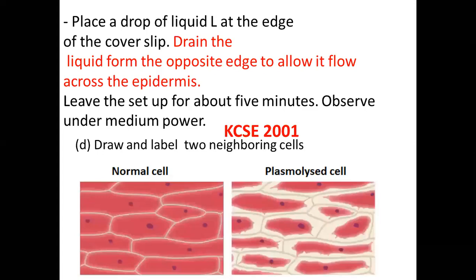And that's why it's also good to know how a normal cell would look, and then how it will get plasmolyzed. So the 2001 practical was another level. And you see, NEC will never shy from bringing a question just because the manipulation skills are difficult. This was honestly a difficult area. And this is something that we will carry along. Hatutasema hii ndio mwisho, now that I've talked about it, this is the end.